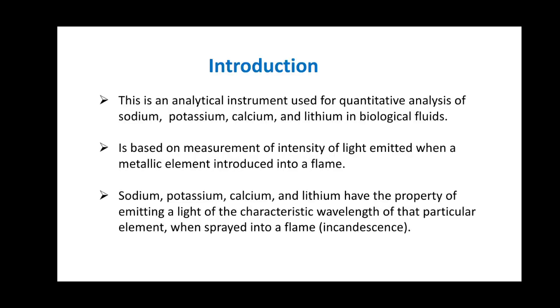Hi everyone, this class is about flame photometry and fluorimetry. So these are the two types of photometry. First, we'll see the introduction part of flame photometry. This is an analytical instrument used for the quantitative analysis of sodium, potassium, calcium and lithium in biological fluids.